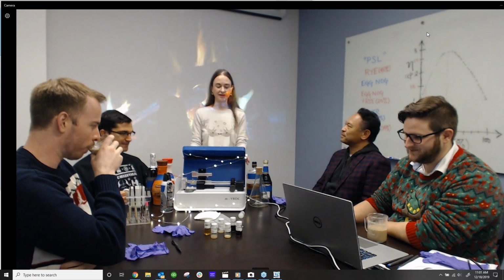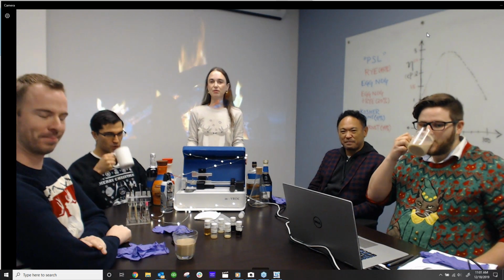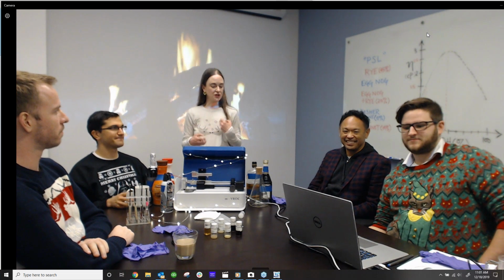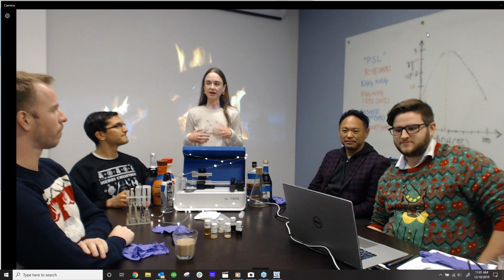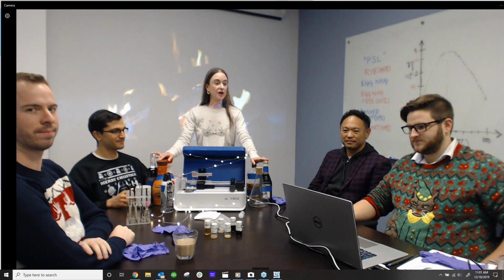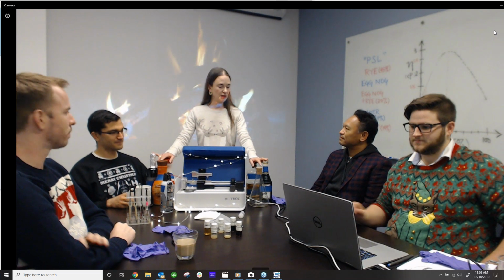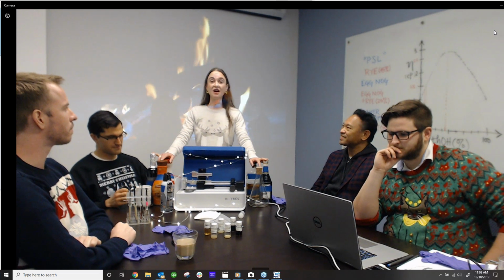Let's get started. Okay. Welcome everyone to December's webinar. It's a bit of a departure. We're not going to have any equations this month. It's going to be a little bit of fun to show you how to use our instrumentation, let you learn a little bit about it and how it works, and then also understand how you can use it in a very practical way. Something very relevant this time of year is you're going to have fun, you're going to be partying, whether you're celebrating Hanukkah, Christmas, or just life.